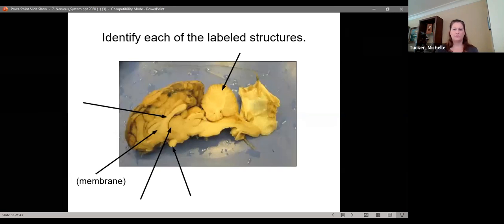Okay, so go ahead and put a heart at the arbor vitae of the cerebellum and an X at the optic chiasma. A little harder. Yep, that's right. It's the glistening white one. An arrow at the thalamus. So the thalamus is going to be over one. It's the round. You can't really see it. It's round.